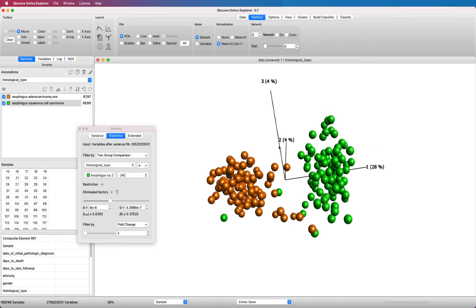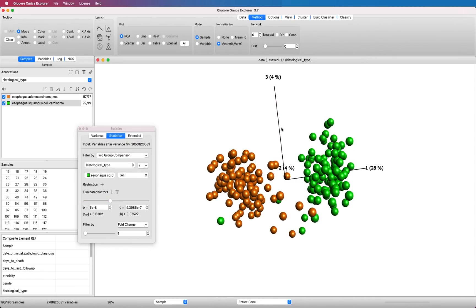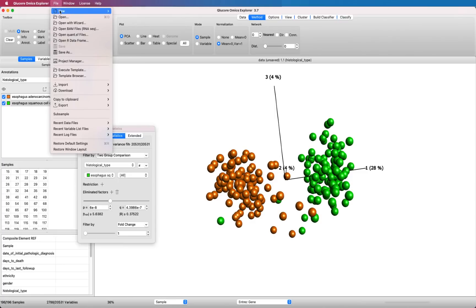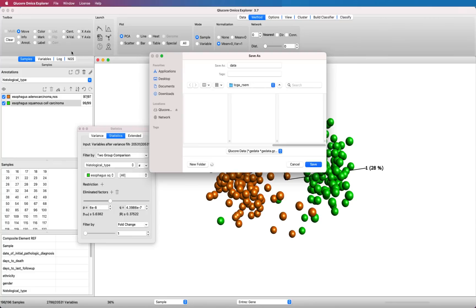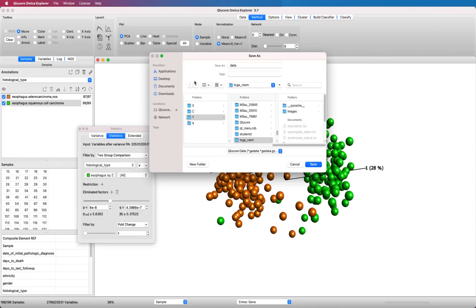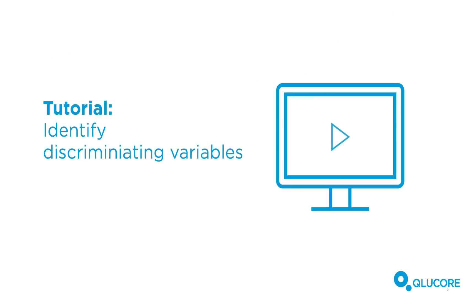Before you close the dataset, we recommend that you save it as a GE data file. Then you can open it up directly next time you want to work with it. To learn more about the statistical analysis, we recommend that you watch the tutorial, Identifying Discriminating Variables.